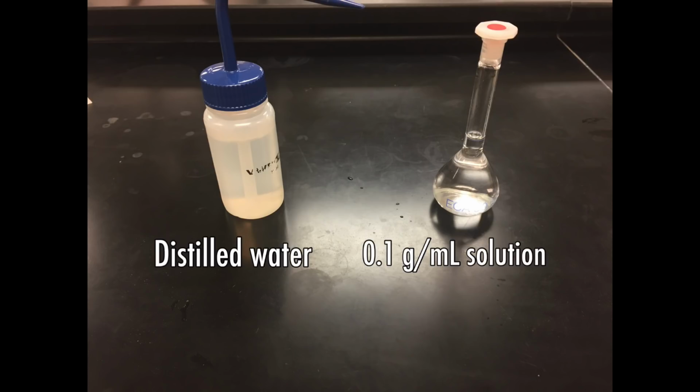Now we are going to introduce how we make solutions with other concentrations using the original 0.1 grams per milliliter solution and distilled water. In this video, we're going to give you examples of 0.04 and 0.08 grams per milliliter solutions.